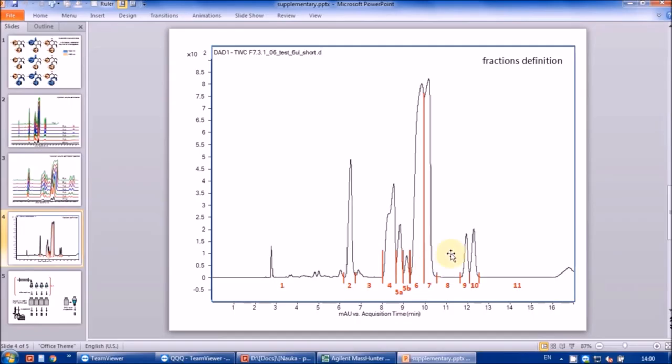If peak overlapping occurs, such as in this case, we can try collecting the leading, the middle, and the trailing part of the overlapped peak as separate fractions. Then the leading and trailing parts will be almost pure, while the middle part will require an additional cycle of separation, but now with lower column loads. In our case, we will just separate the leading and trailing parts and then purify each one.